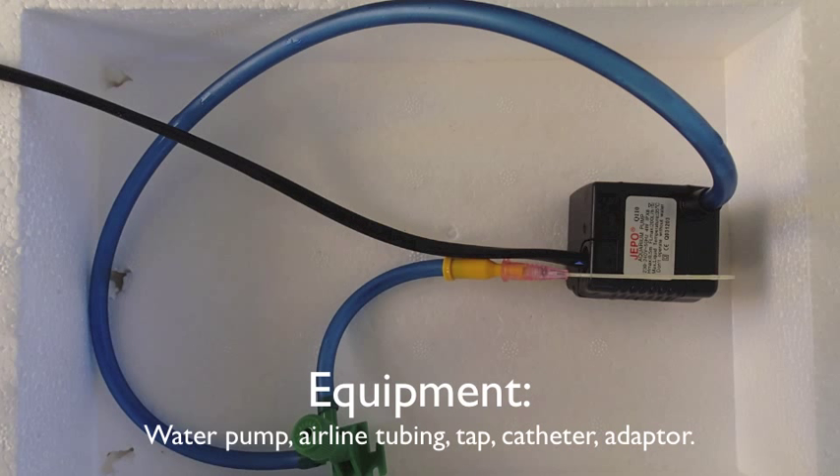To set up a recirculating fish anesthetic circuit, all you need is a water pump, airline tubing, a tap, a catheter and an adapter.